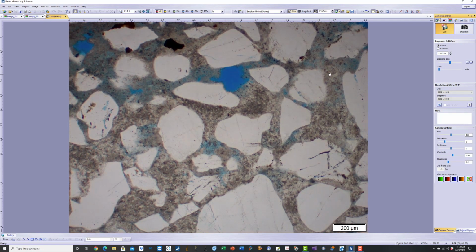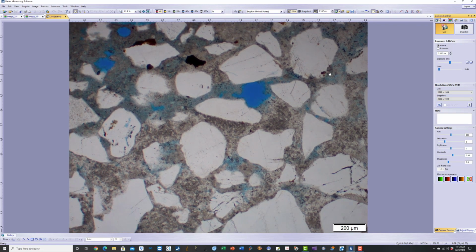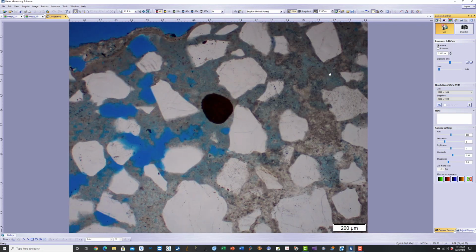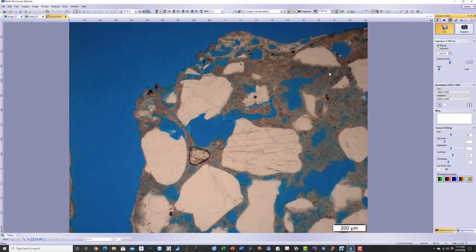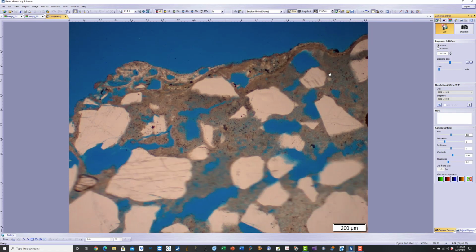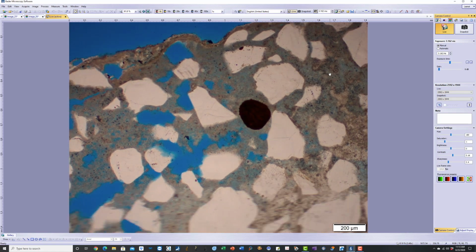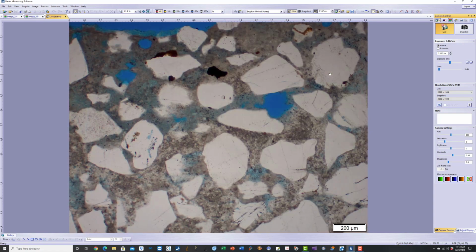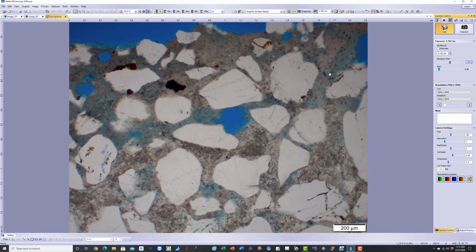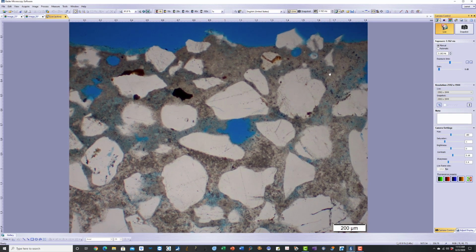Usually in pavers, the jointing mortars are either 1:1 or 1:3 ratios of cement to sand. Also, hydrated lime is used in many mortars to improve the workability and water retention properties. But in this particular jointing mortar, 1 part Portland cement and 2 parts silica sand was used.